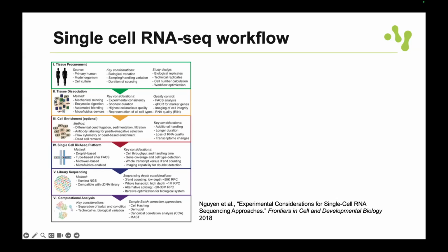And then sometimes you need to do a cell enrichment. Maybe you have a very tricky tissue, and if it's a lengthy protocol for the tissue dissociation, you might need a dead cell removal step to remove the dead cells to get better quality data. It's good to spend not only time reading but also trying out these steps, so you're sure you have good quality.